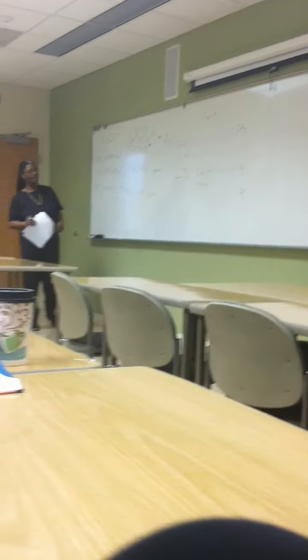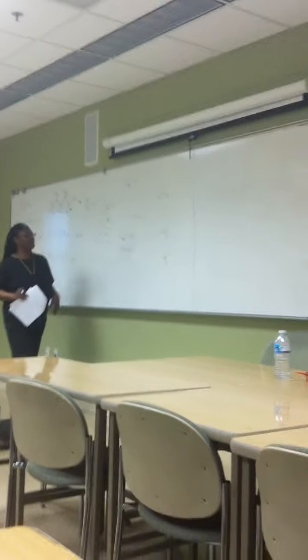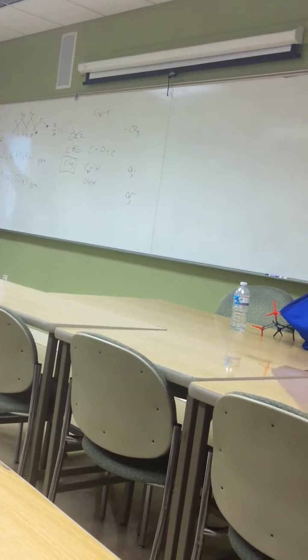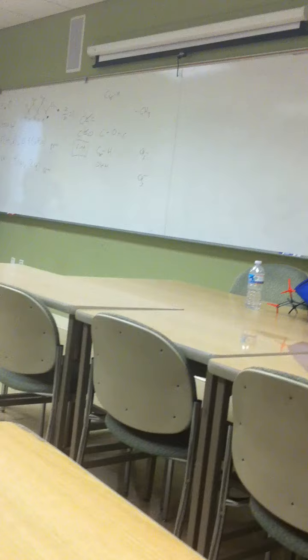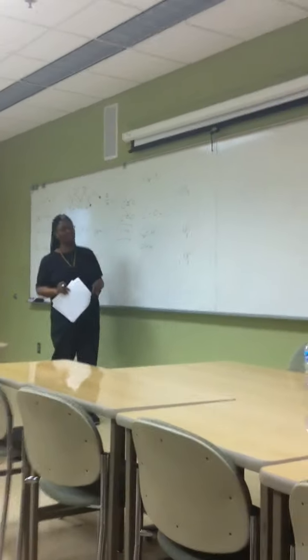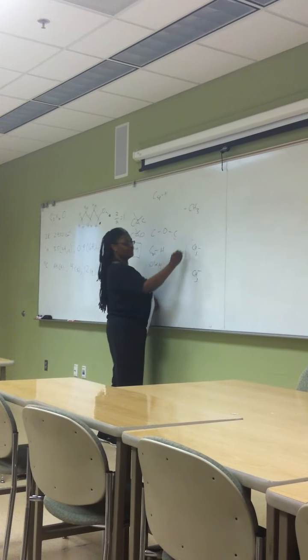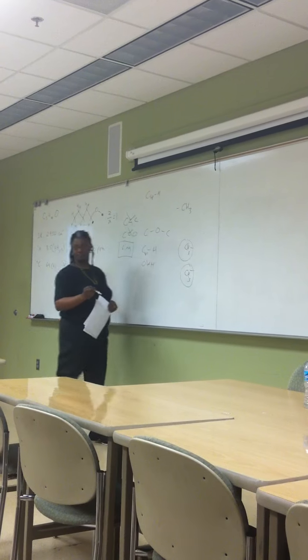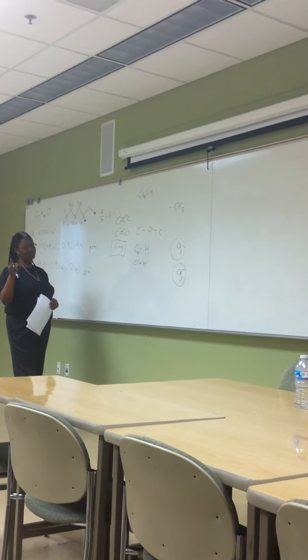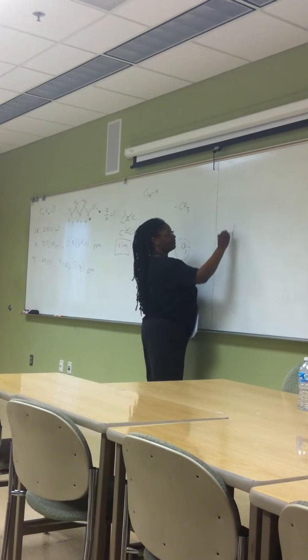So also, if we have 2 that are methyls, if it's CH3, that means it can't be in a ring, because otherwise you would need to have 5 bonds to a carbon. So 5 minus 2, that means you're going to have a ring with 3 carbons and an oxygen in it. So we had determined before it's an ether, it means it's a cyclic ether. 3 carbons and an oxygen, because we've already identified 2 methyls. So these are 3 other carbons. And then there's also an ether.